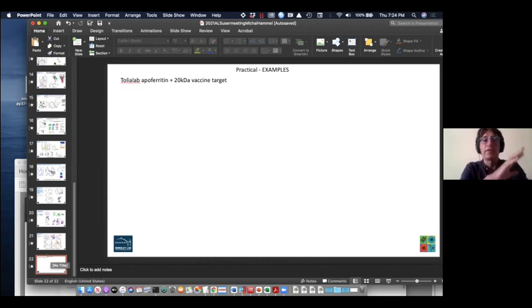We have had success even with small compounds, because some of the small drugs can form aggregations, trimers or tetramers, and we are able to separate them from the single species and see this. It really needs to be tuned up, and you know your system better than we do. So all these changes in a column, as Rob said, you need to be nice to beamline scientists.